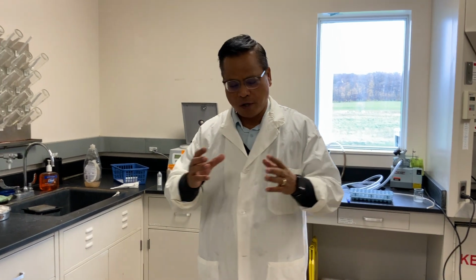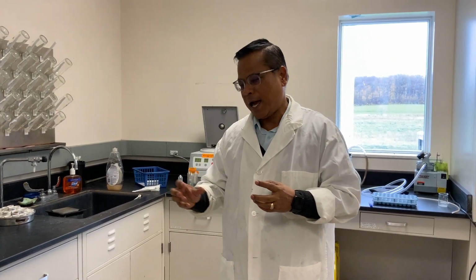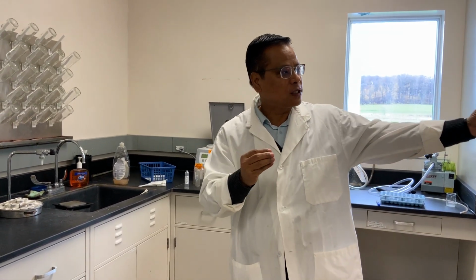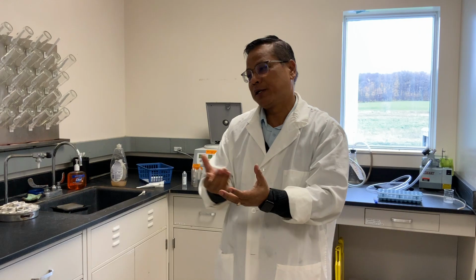So with this system, what we are trying to do with the spectral analysis system is that we will create a library of the spectral signature of the wastewater before treatment and after treatment, and we will have the gravimetric analysis also in place, so that the spectral data that we get correlates with your gravimetric method, because we know for sure the gravimetric method is very reliable, and you could exactly come up with the TS and TSS.